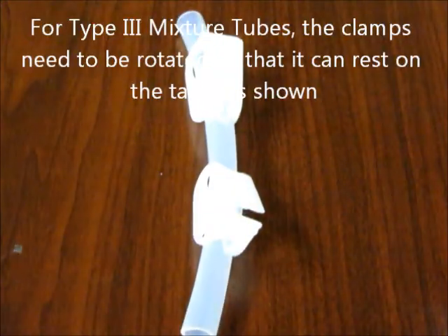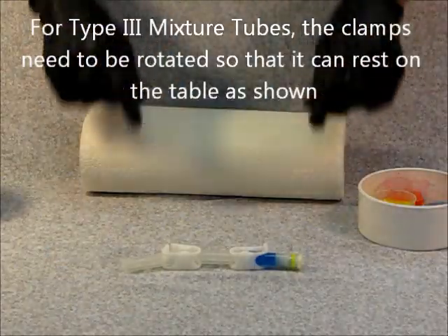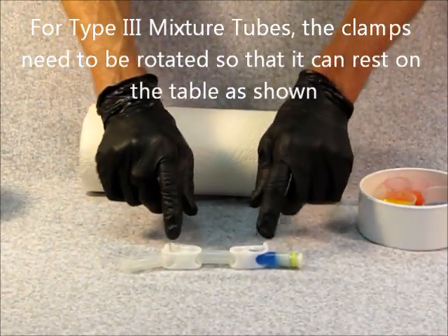The tube should now look like this. For a type 3 mixture tube, the clamps need to be rotated so it can rest on the table as shown here.